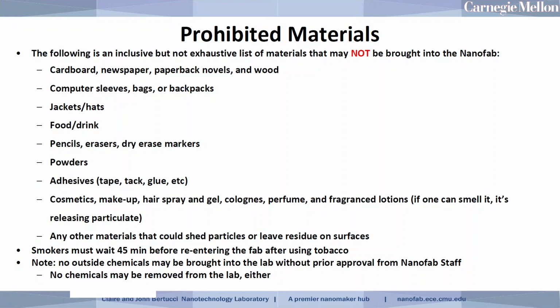I also want to make a note that no chemicals can be removed from the lab either. Even though we allow folks to purchase things like resists, and we have solvents available and other chemicals in the lab, acids and bases, nothing should be brought out of the lab and taken back to your lab. Again, that would put us in violation of EH&S protocols. So if you have any questions about our chemical policy, please feel free to reach out to the staff.